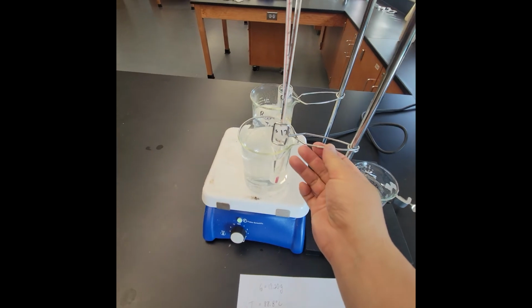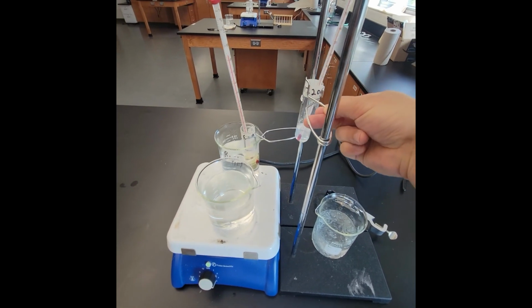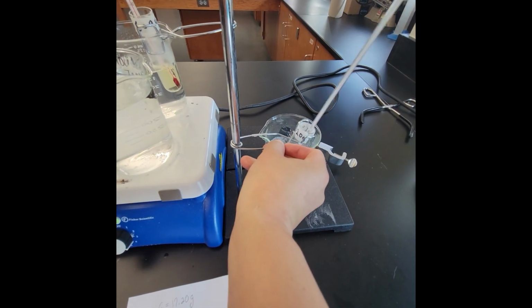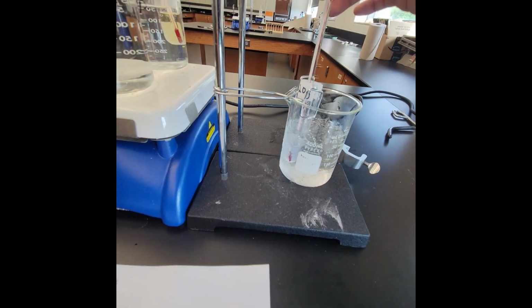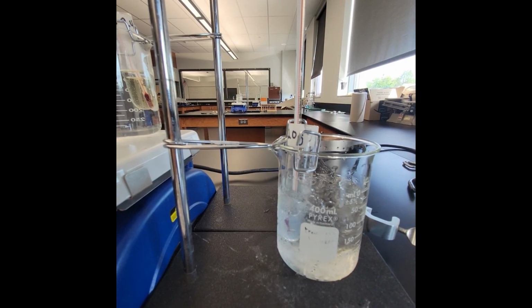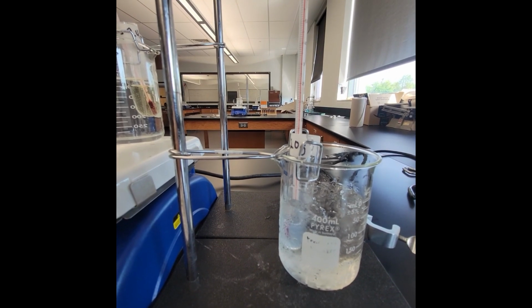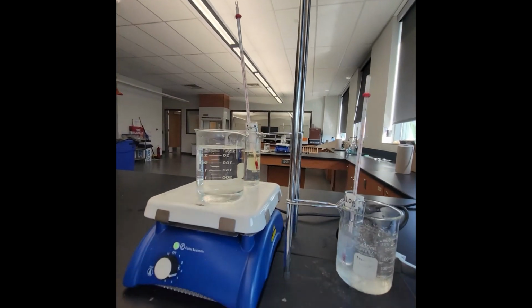I'm going to move that guy over to the ice water bath and record every 10 seconds. I'm working by myself, so I gotta try to keep the bulb submerged in the liquid without touching the sides of the test tube. So I was 78.